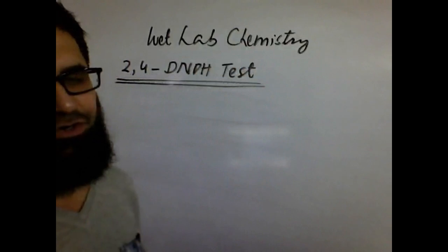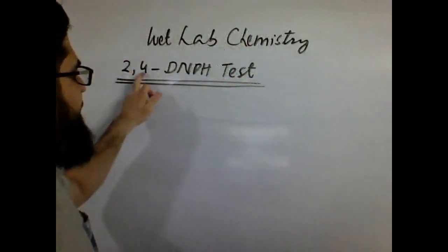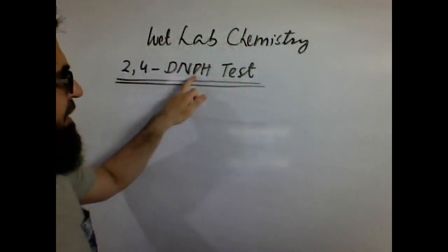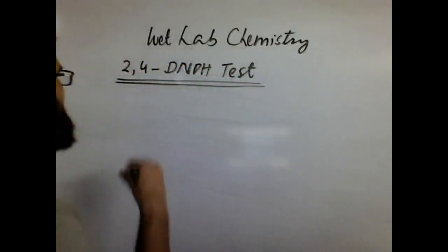The exact name for the test is the 2,4-dinitrophenylhydrazine test.